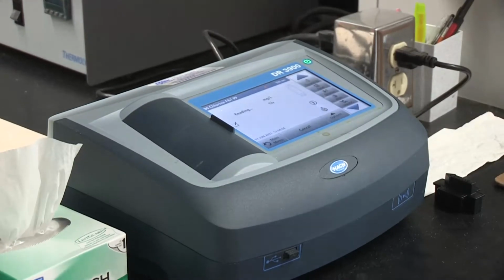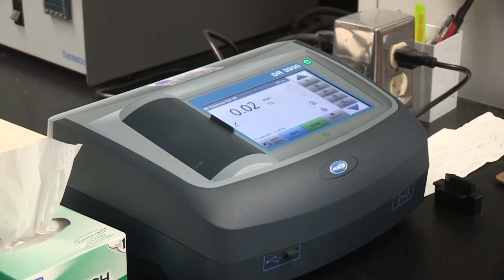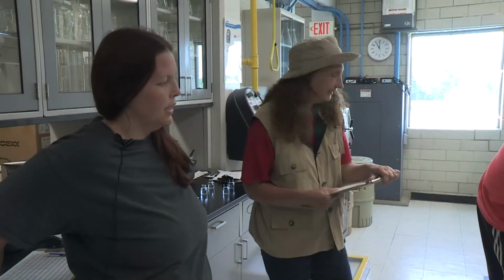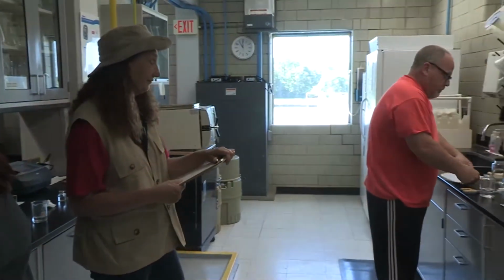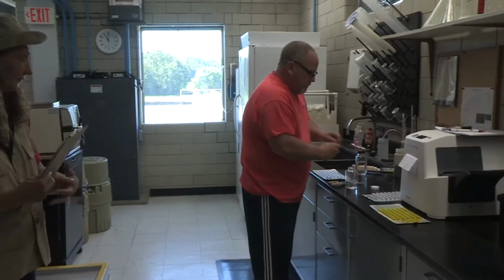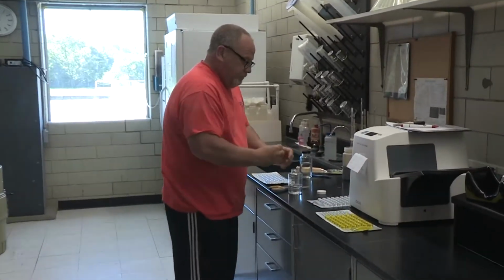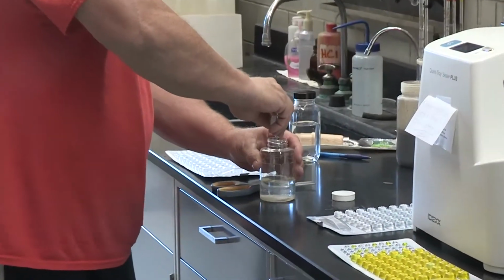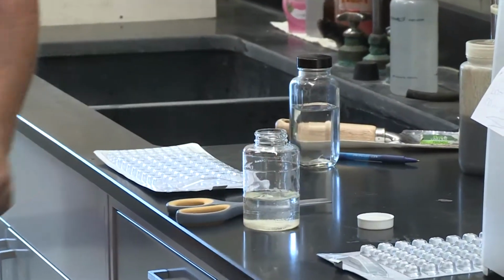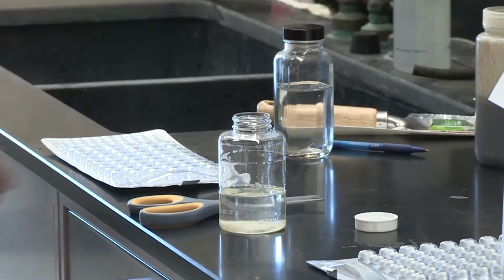So what happens if one of those turns pink? What are you going to have to do then? We would just go and adjust the chemical. Add more chemical to your treatment area? Okay, cool. So now he is going to test if there's any E. coli present in the water. So we have to make sure that there isn't anything harmful that we're returning. That's why we use the chlorine. So we put chlorine outside, and it goes into 3 different tanks, and that mixes with the water, and that's supposed to kill anything harmful that could come in.